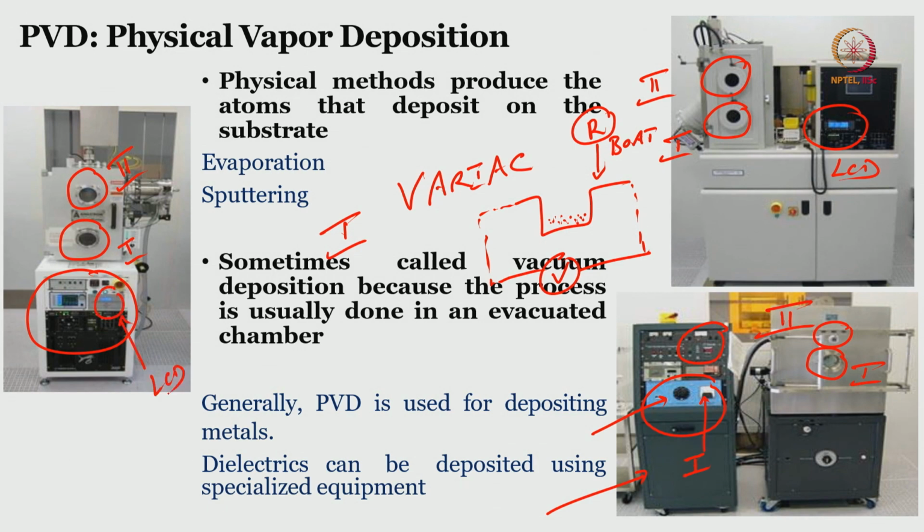Here you can see very clearly the rate of deposition, and we can measure this rate in terms of angstrom per second.